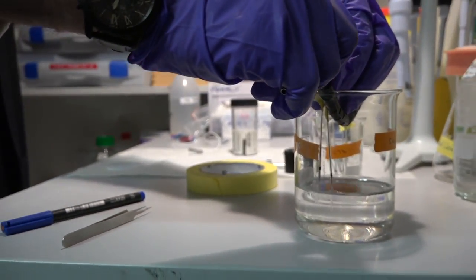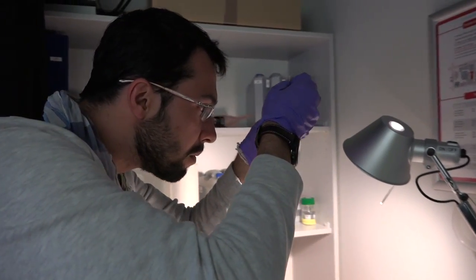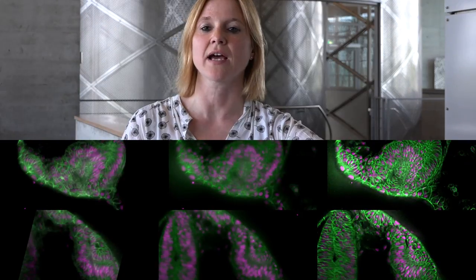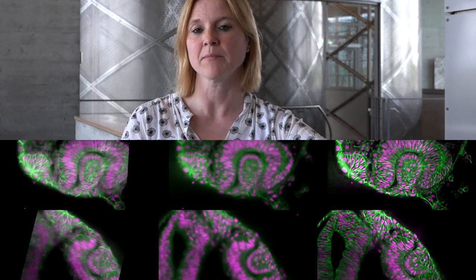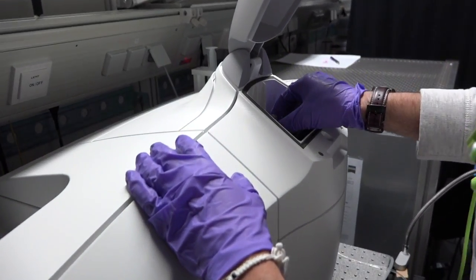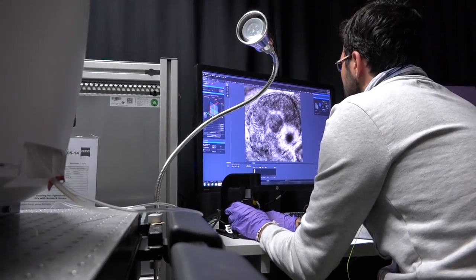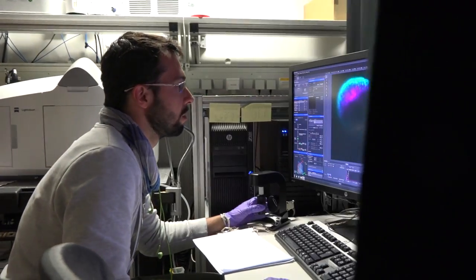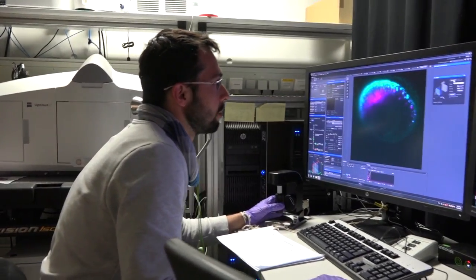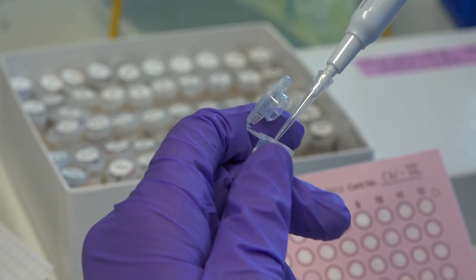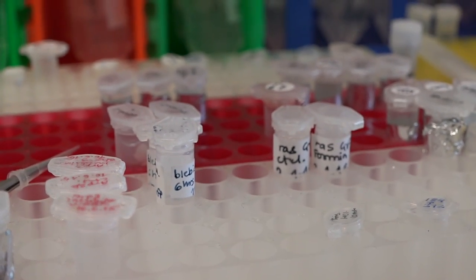To understand how cells behave in this very crowded environment and how cells get to the right place at the right time, the methods we use are mainly imaging methods. We use very different microscopes and we really operate at the border between developmental and cell biology. We want to understand how tissues behave, but we also want to understand how the cells within this tissue behave, and to this end we have to look also into the cells.